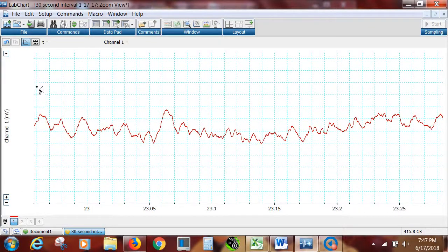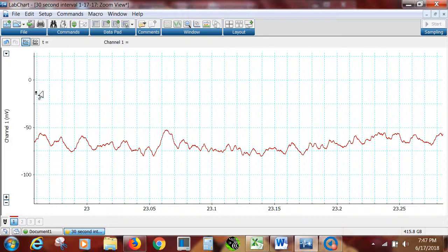And let's see what we can do out of this. So we said 23. There's 23. Now we want to count the number of minis. This is really a very difficult file, I think, because of how to count the number of minis that are occurring in here. There are a lot of minis.